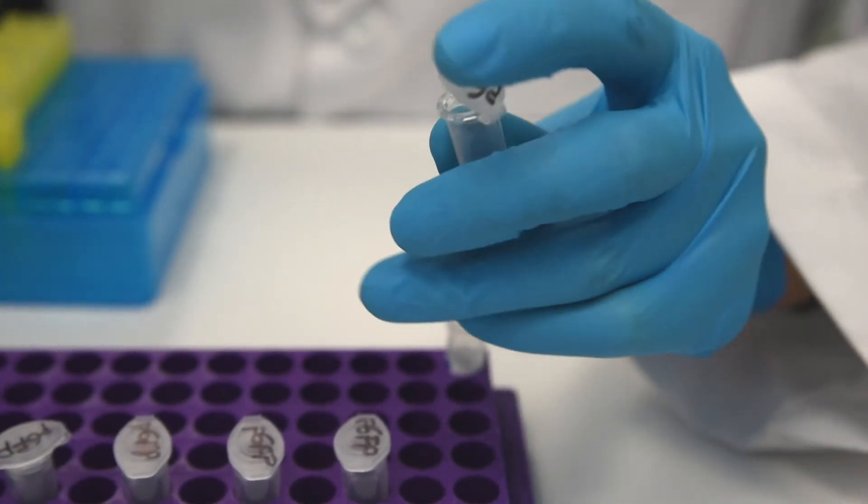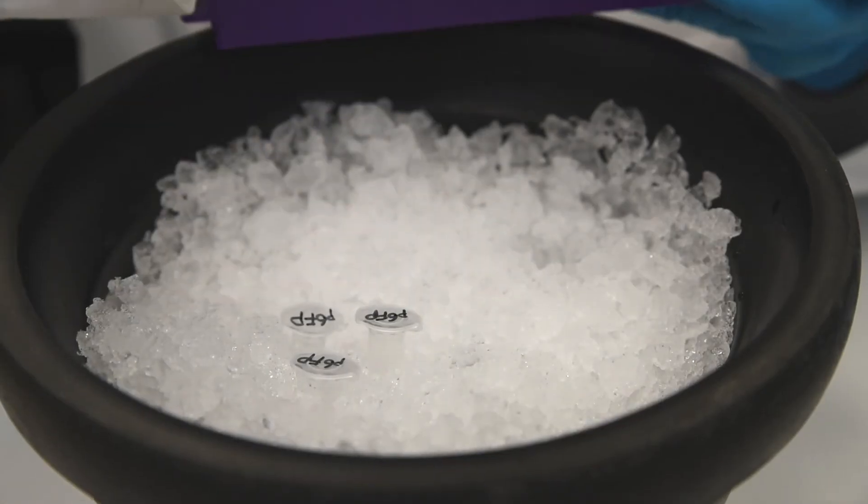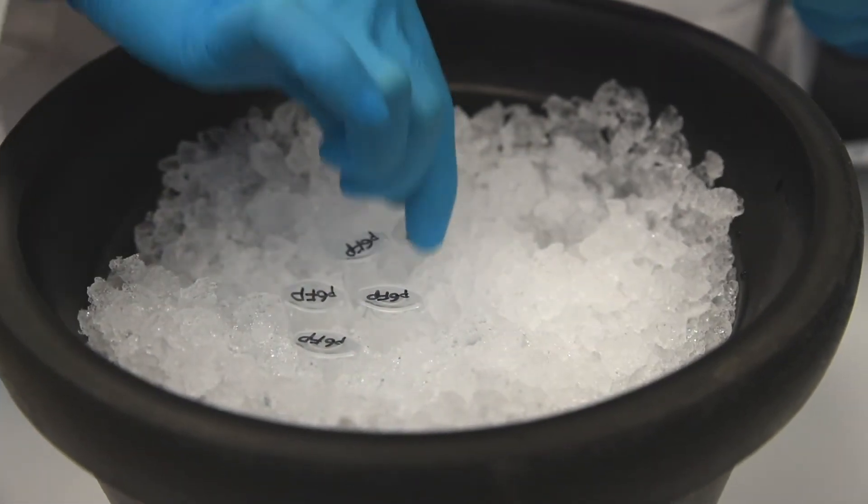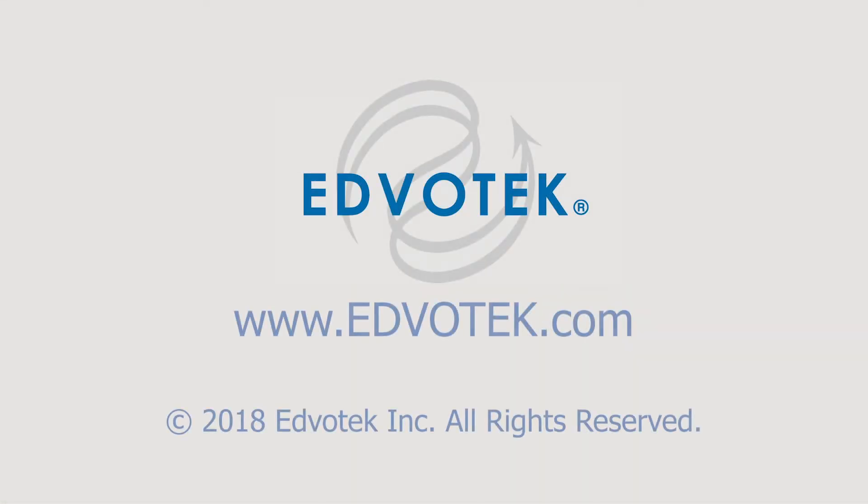Step 8: Using an adjustable volume micropipette, dispense 12 microliters of the plasmid DNA to each of the microcentrifuge tubes labeled pGFP. Cap the tubes and place them on ice. You are now ready for students to perform Module 1: Transformation of E. coli with GFP.